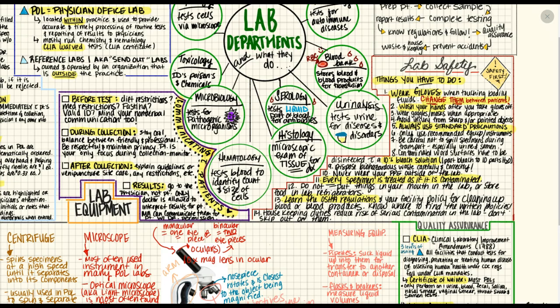Number 10, never wear your PPE outside of the lab. There was a rule in every lab that I worked in, you never wore your lab coat outside of the lab because you could be carrying pathogens or other icky things from inside the lab to the outside world and contaminate people outside or other surfaces outside, and you just don't want to do that. So you don't want to wear anything that you've been wearing inside the lab to the outside. We just hang them up and leave them in there and then put them back on when we come back in. Every specimen is treated as if it's contaminated, so that's a good rule of thumb to live by.